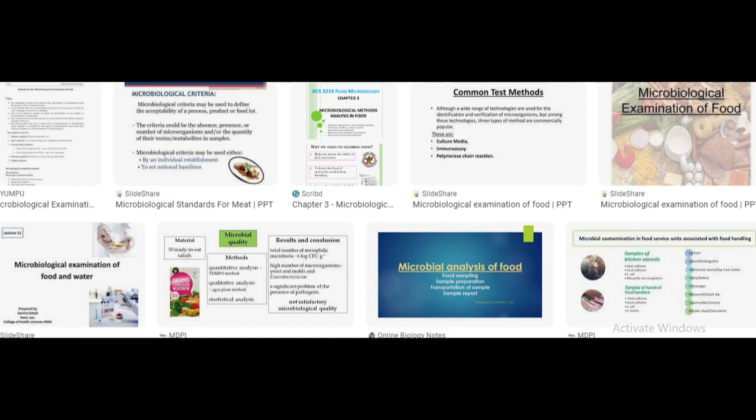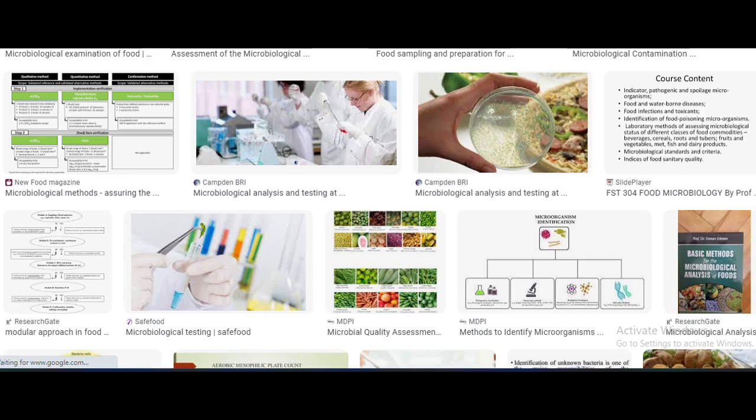But E. coli is not a pathogen, and it is found in the coliform test, so it will be taken up for processing. For your knowledge, there are many other organisms that can be used as indicators, but E. coli is still the best based on advantages and disadvantages. Now, let's look at direct examination.